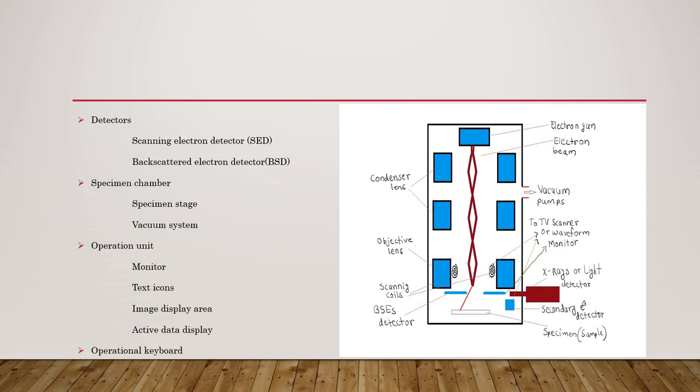This will vary depending on the age and type of the machine, but as an example, it consists of an oil rotary pump and an oil diffusion pump. The backing pump is used for rough evacuation while the diffusion pump achieves higher vacuums.